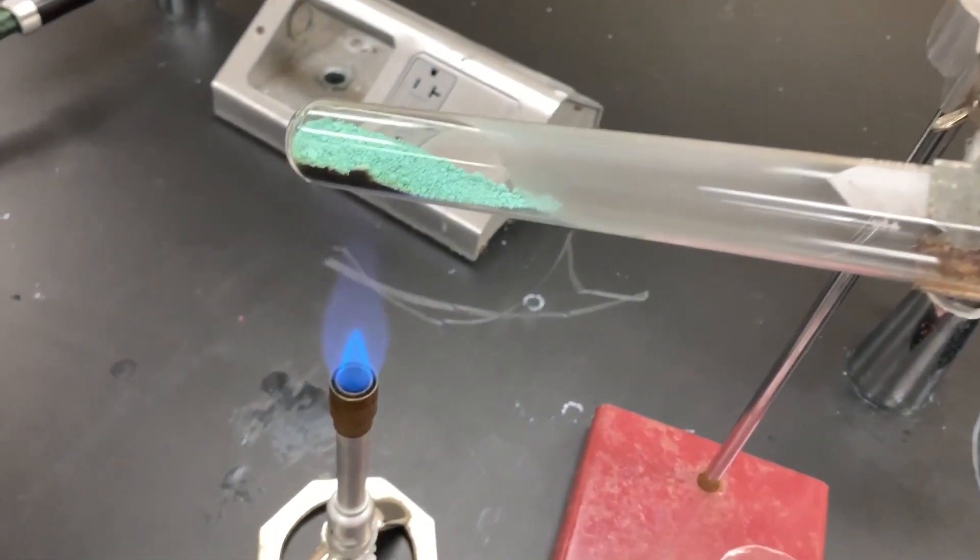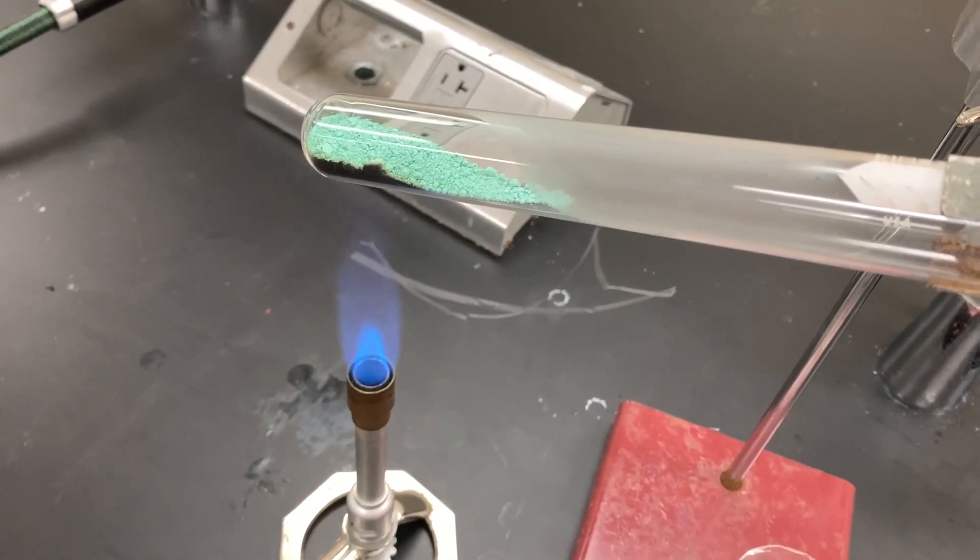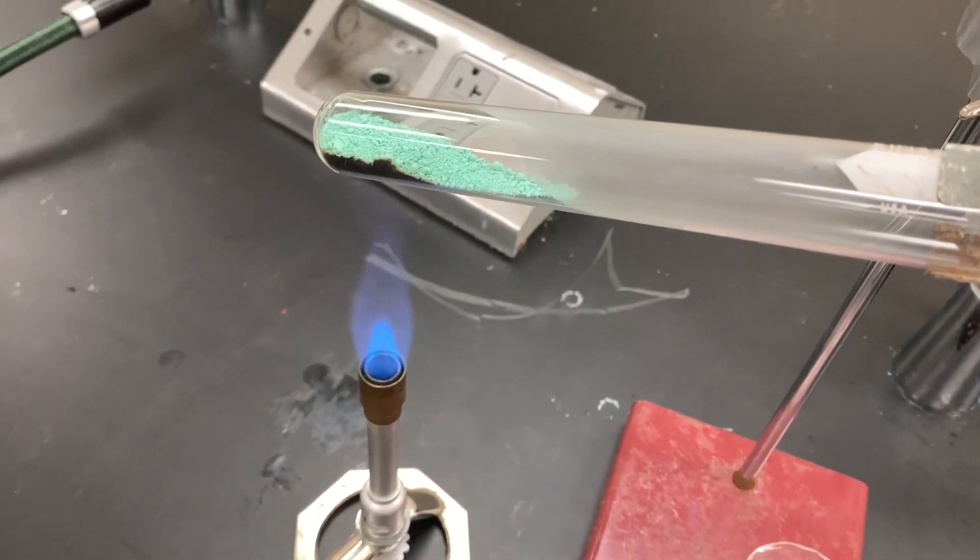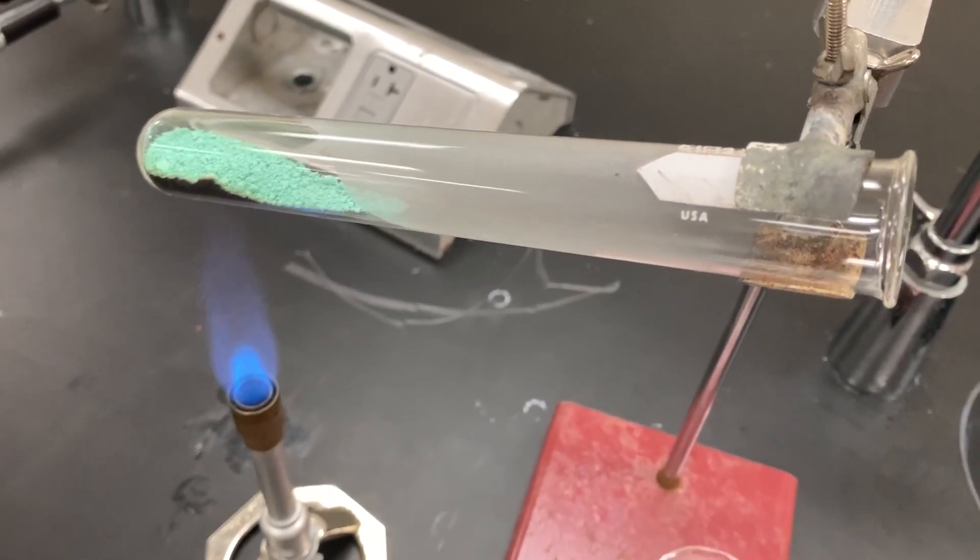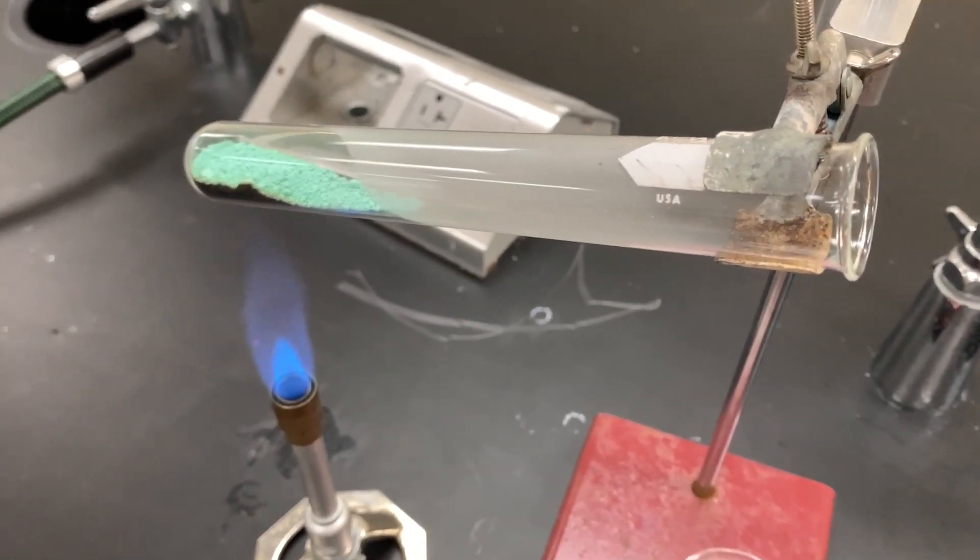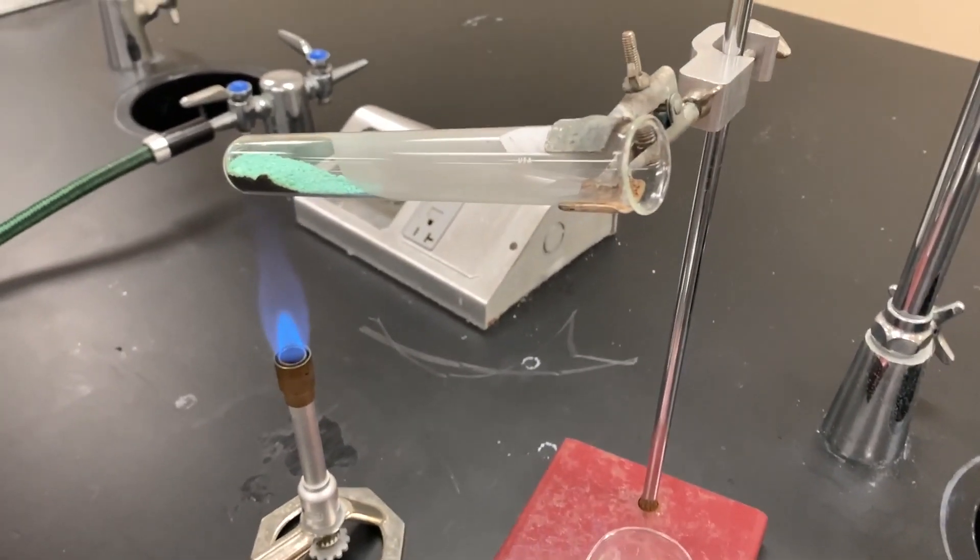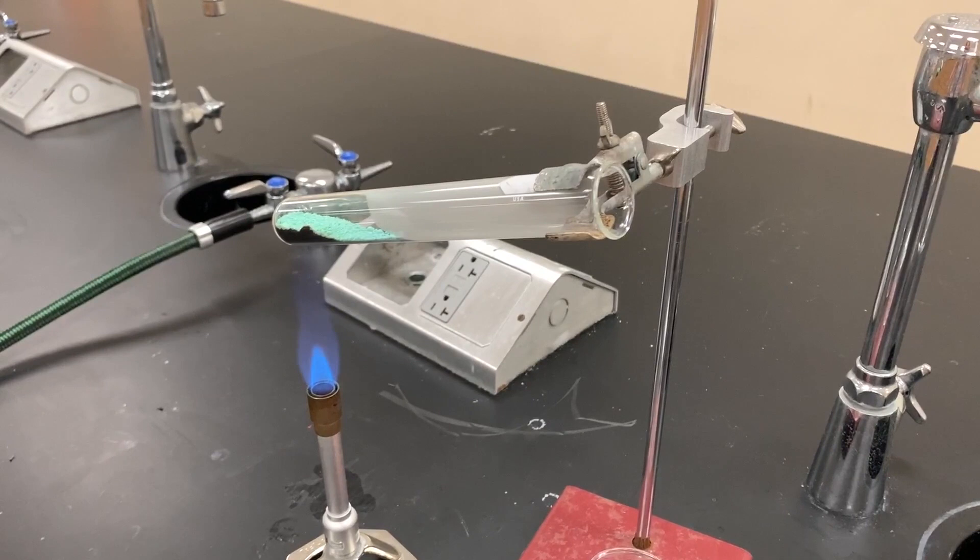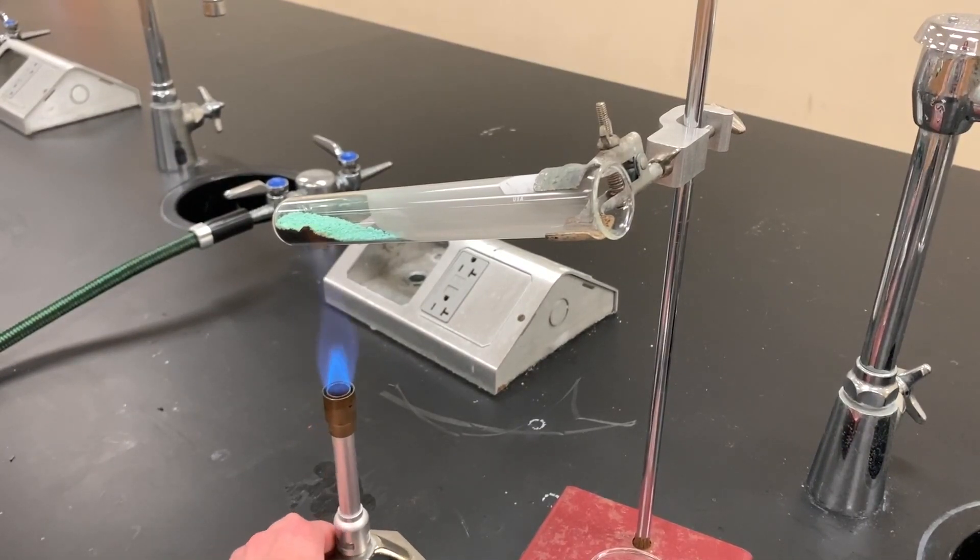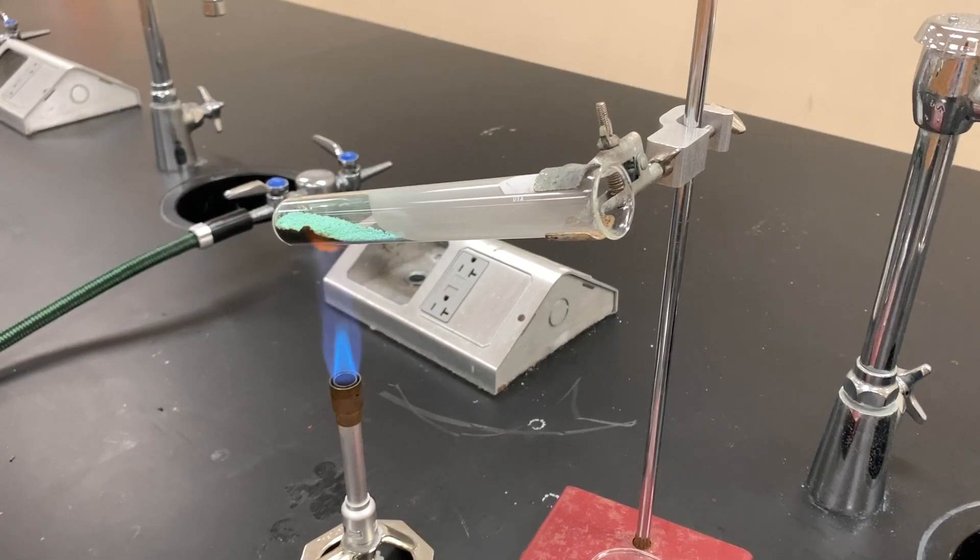You are seeing some evidence of the bluish green solid turning into a black solid. That looks like water condensing on the inside of the test tube. To test for carbon dioxide we have to do something different. I'm going to increase the heat and do two tests for carbon dioxide being present.